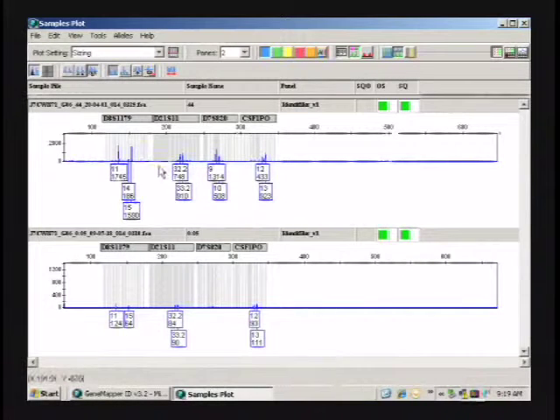And this is it after 2 washes. So you can see that somewhere it's kind of close to a 10-fold increase. Now notice these 2 markers down there, D7.